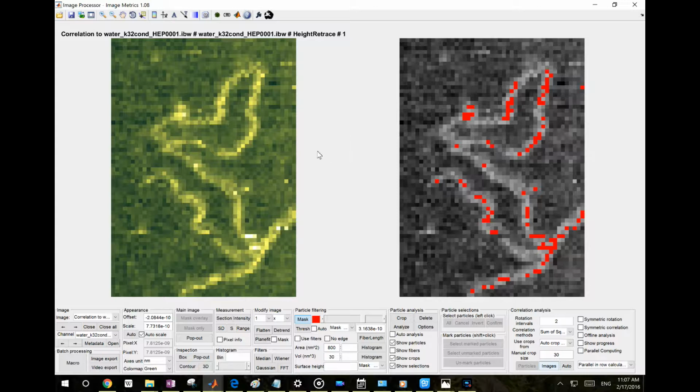Finally, I'm going to show examples of how to use correlation averaging in periodic structures, especially in protein crystals, and all kinds of other images. A specific advantage of image metrics is that it can be used to analyze images that are not protein crystals, meaning particles that can be randomly aligned.